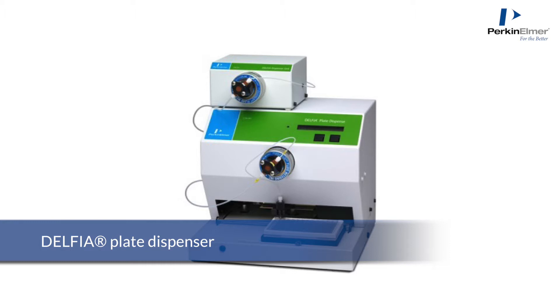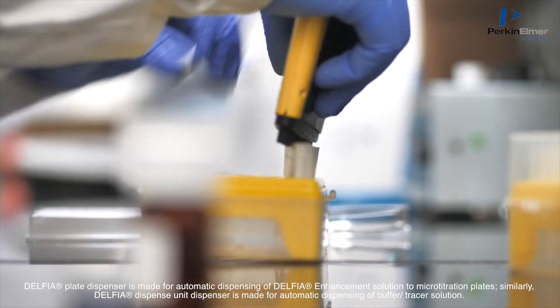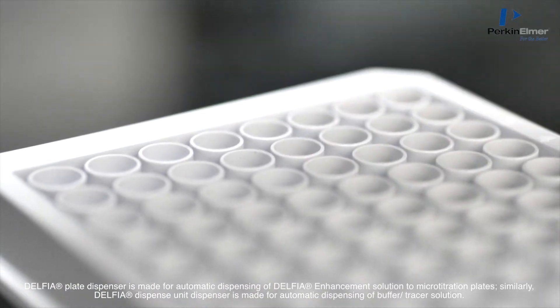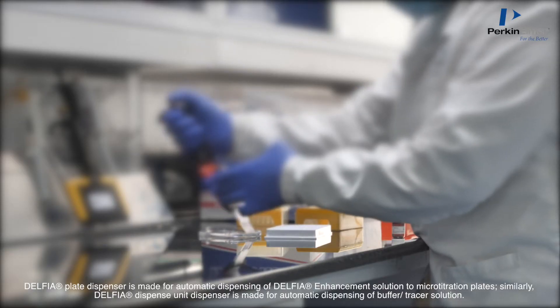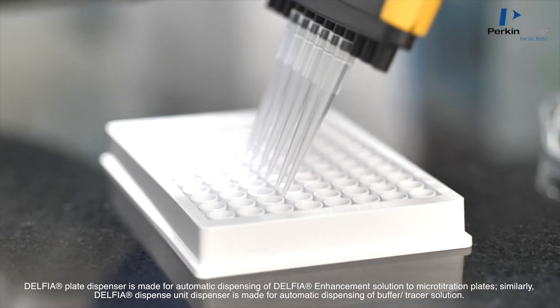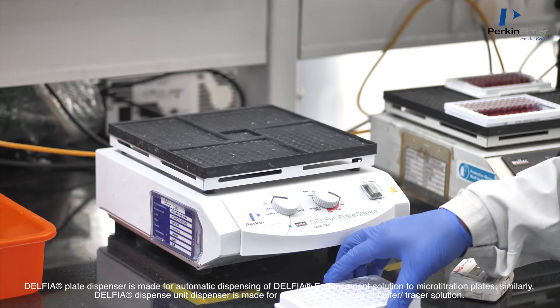The Delphia Plate Dispenser is made for automatic dispensing of Delphia Enhancement Solution to micro-titration plates. Similarly, the Delphia Dispense Unit Dispenser is made for automatic dispensing of buffer or tracer solution.